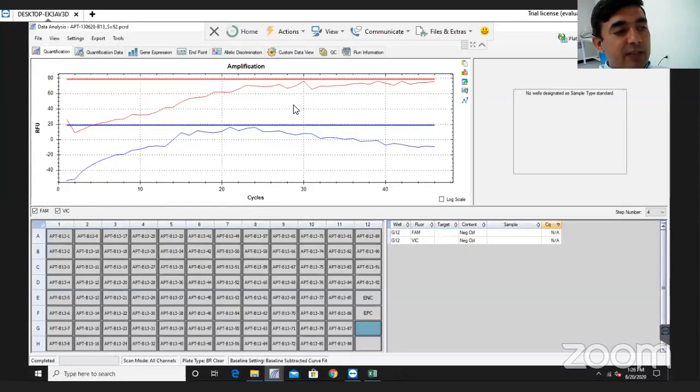the master mix, the water, the buffer we are using for this preparation, is clear or free of all types of contaminants. There is no DNA or no extra RNA present in this sample. So it validates our process of this PCR amplification. It's actually a very important process for the validation of the PCR.